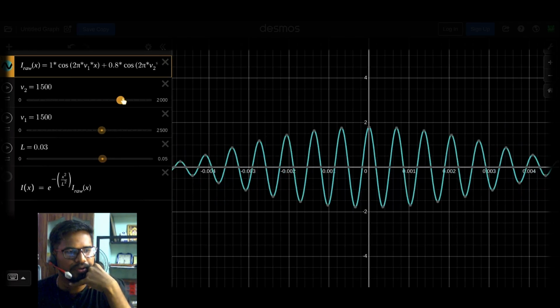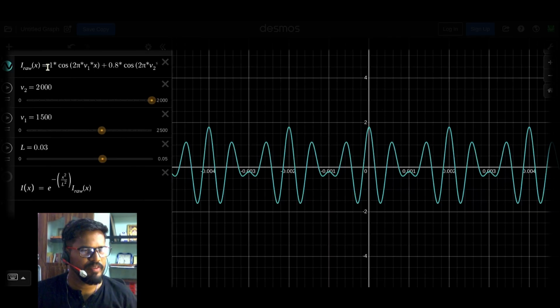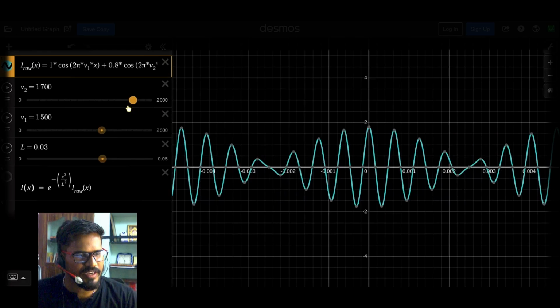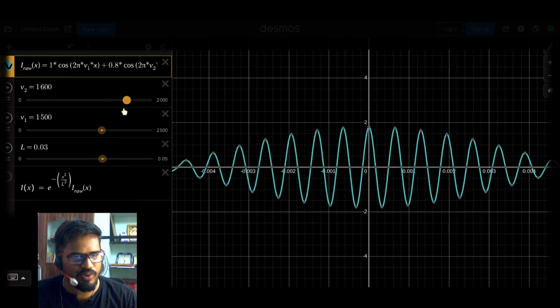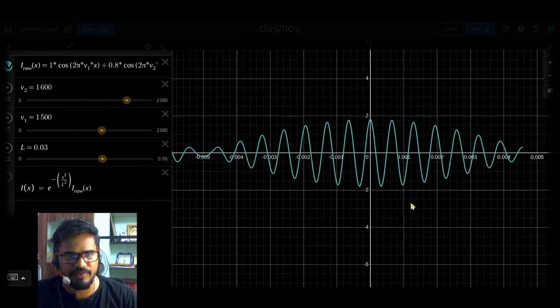So had your signal been this, with absorption going on at 1500 and 2000, you will be getting a raw signal like this. And this signal is a function of time because path difference is ultimately a function of time, your moving mirror. This will be two spikes. So there will be a few things. This is not all pure interference. In fact, if I get it very close to 1500, notice I'm getting beats, right? 1600, 1500, I'm getting beats.